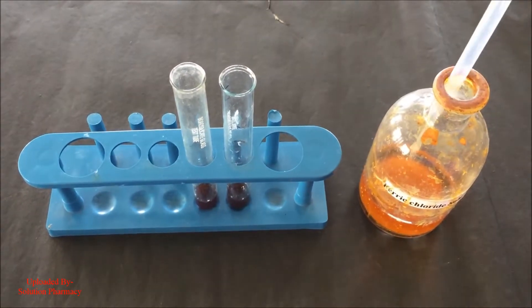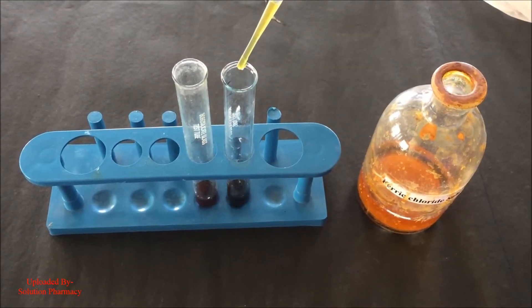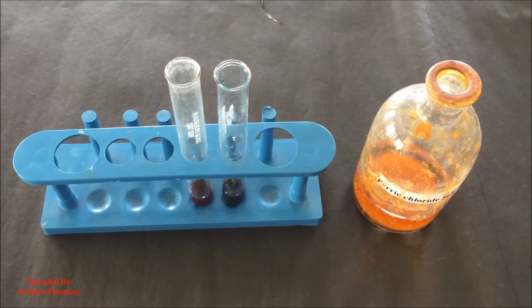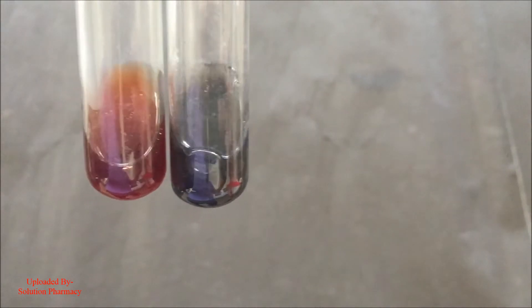To the one test tube, add few drops of 5% ferric chloride solution. If the color of the extract changes to dark green color, then it contains condensed tannin, and if it changes to dark blue color, then it is hydrolyzable tannin. In this extract, the color changes to dark green color, which means the extract contains condensed tannin.